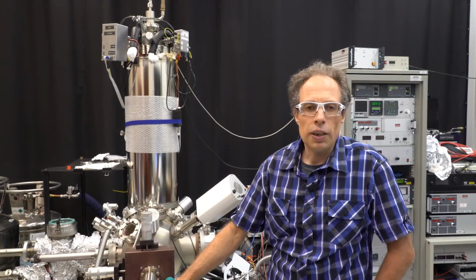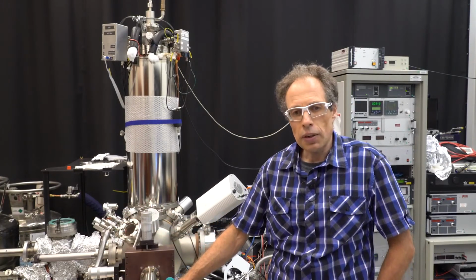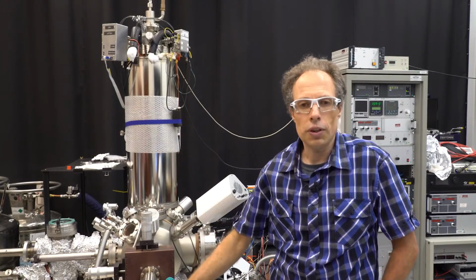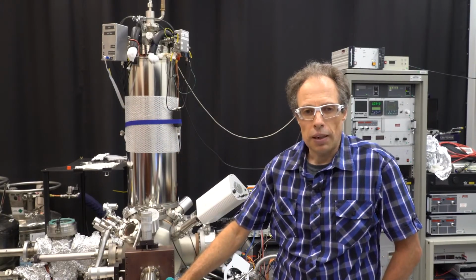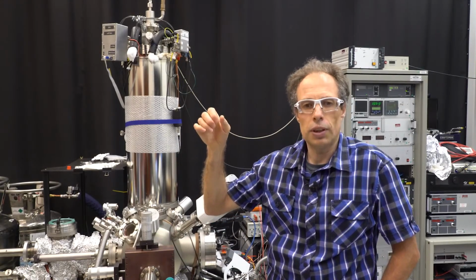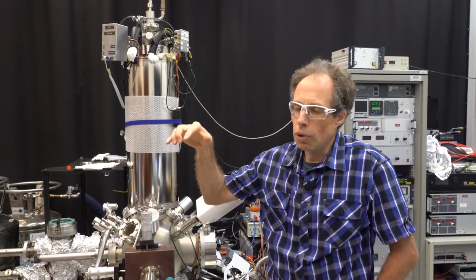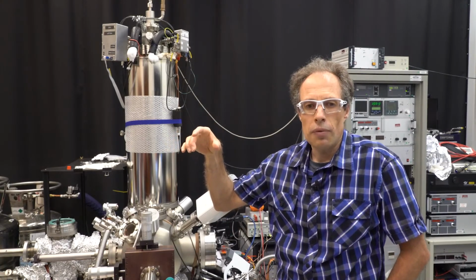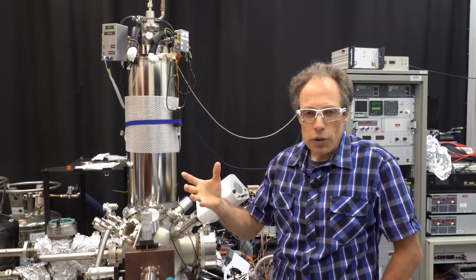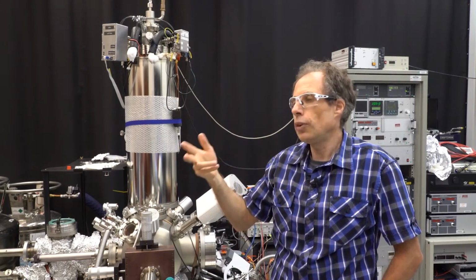to look at molecules undisturbed. So that's very important, as I have that clean environment. This microscope is a scanning microscope, and it scans line by line with a fine tip over a surface and reassembles an image from that. It uses an atomically sharp tip, and the tip end in this case can be specifically functionalized with a carbon monoxide molecule to be non-reactive, to go really close to molecules on the surface without disturbing them, without reacting with them, because only then can I image the molecules as they are. So I'm measuring the force between my tip and the molecules while scanning over them line by line, and that gets reassembled in an image.